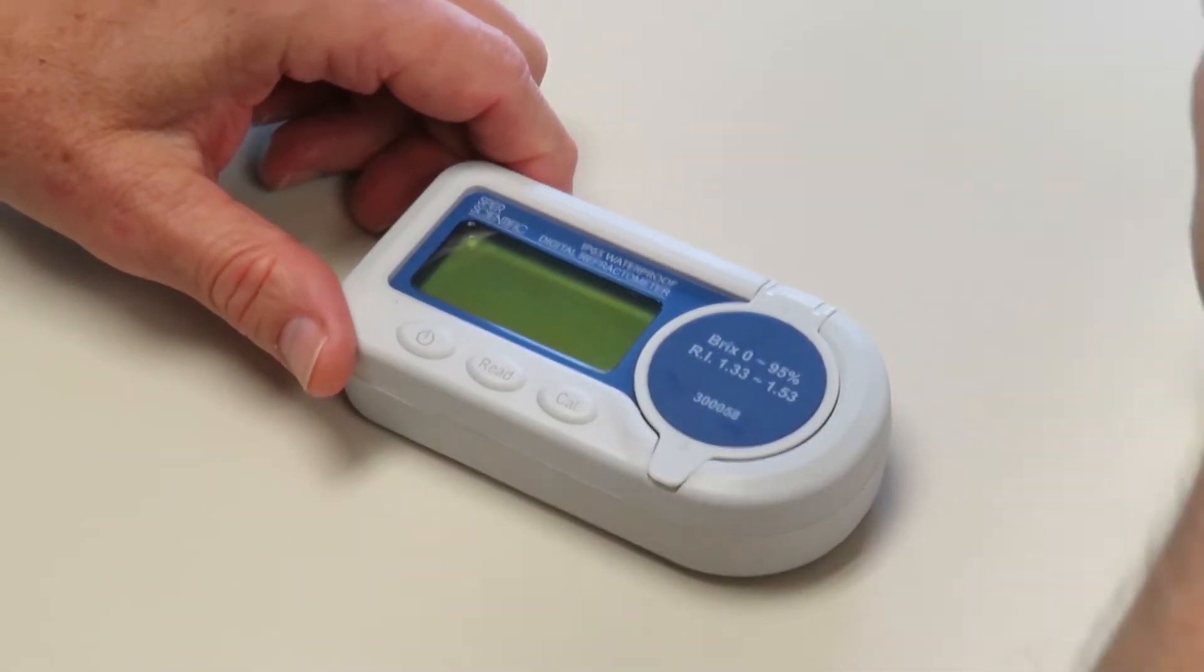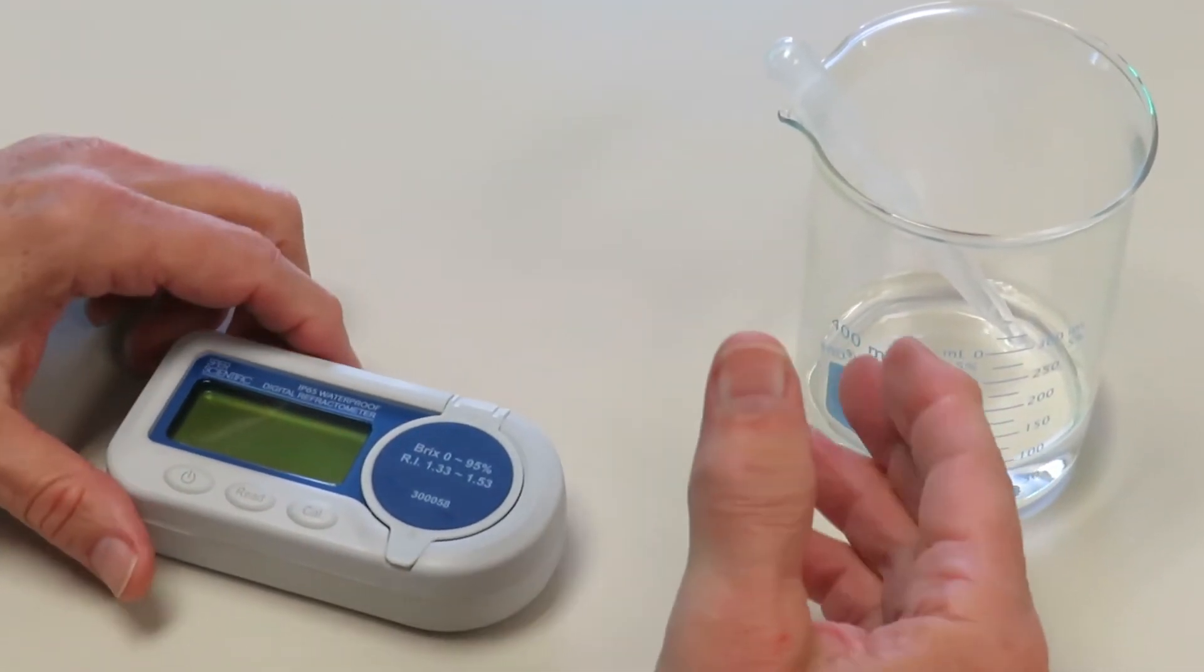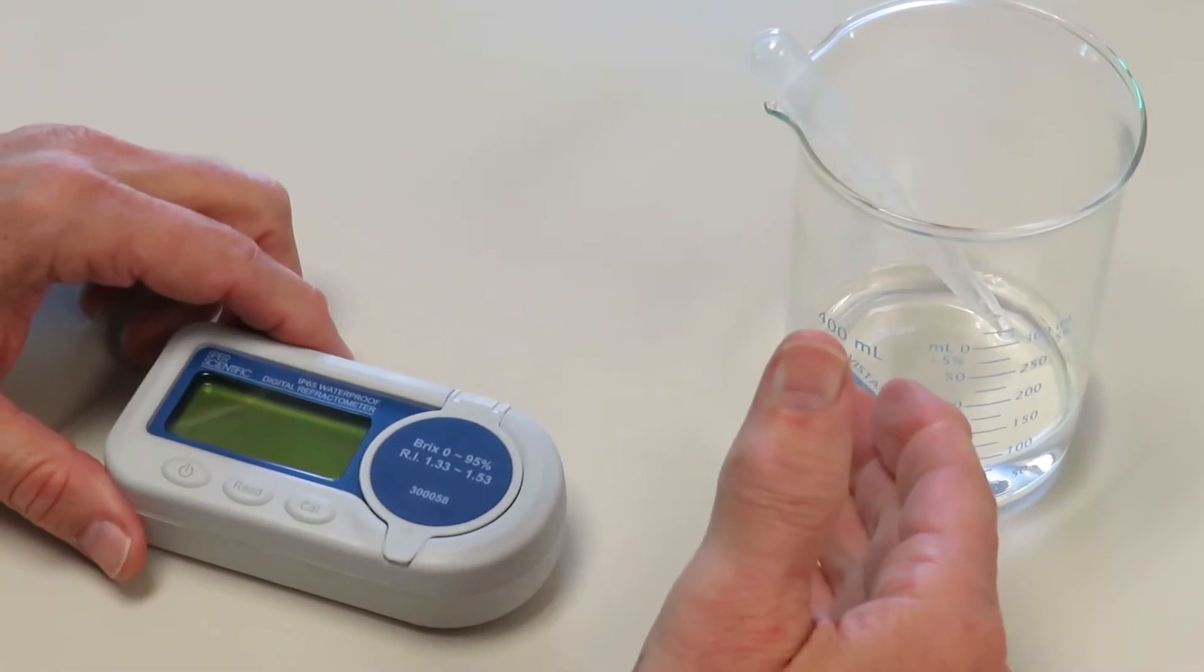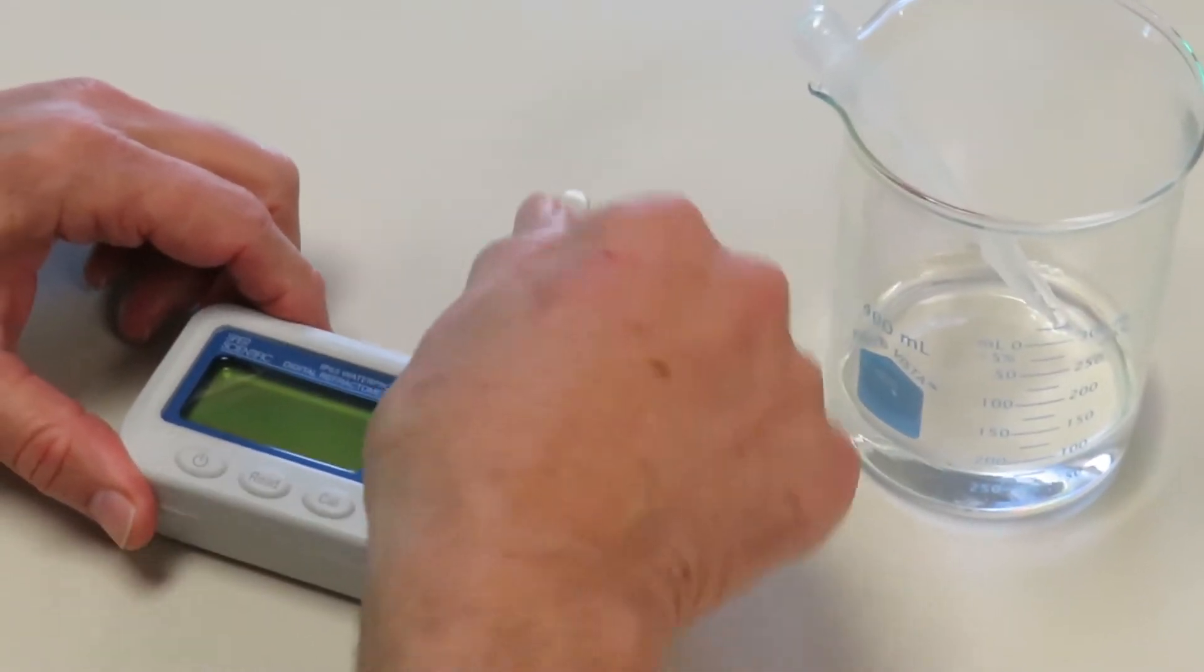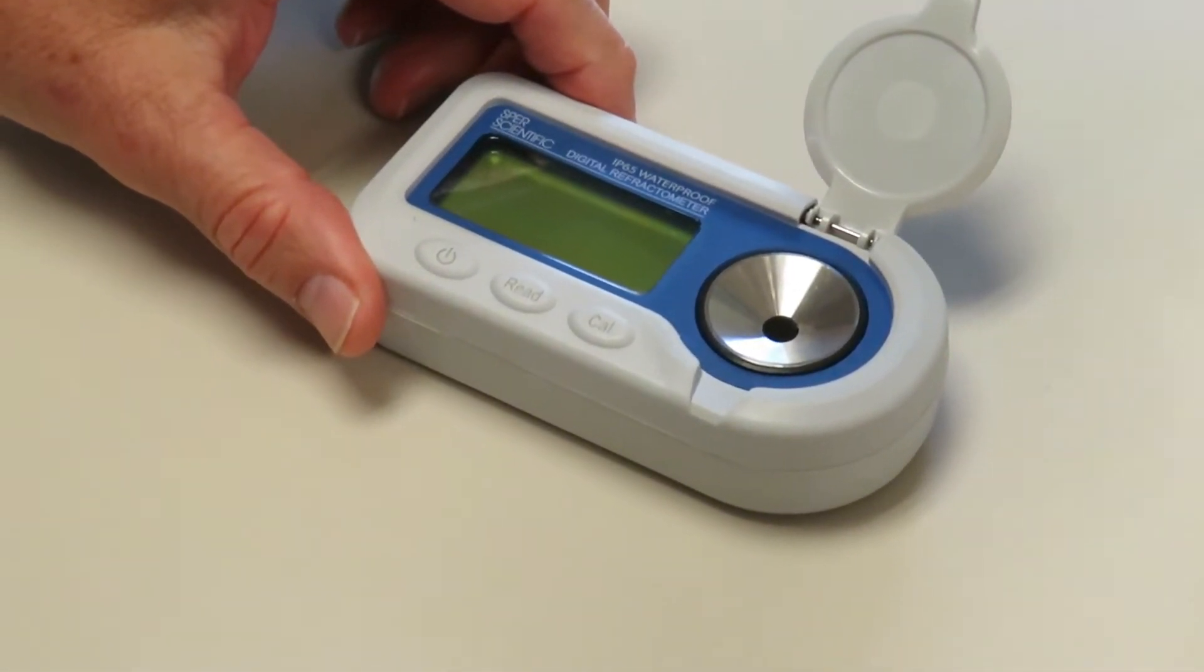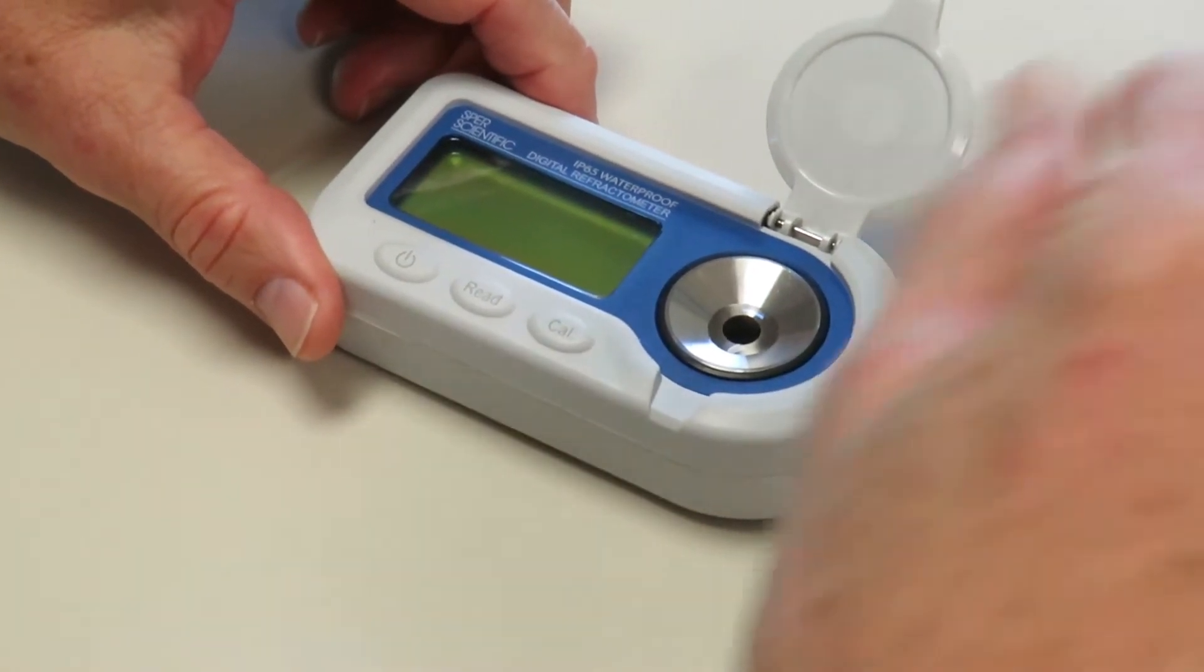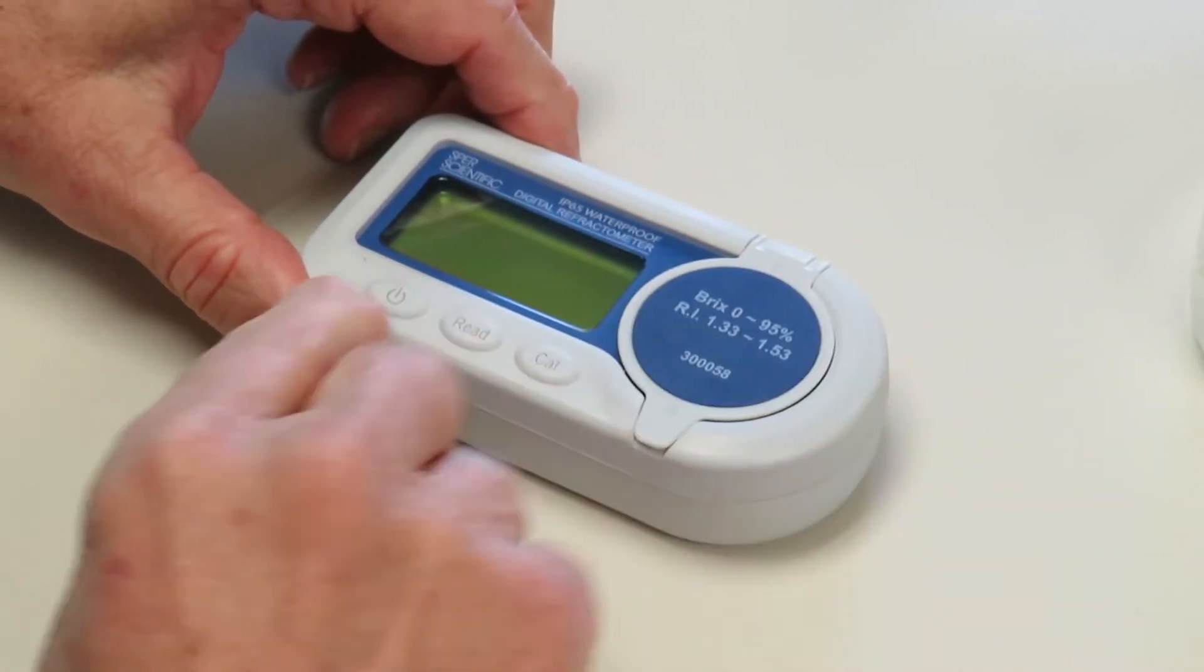First we'll calibrate it and we'll use distilled water. Now that's an advantage because if it was a calibration solution, that solution would evaporate over time and no longer have the same value, whereas distilled water always remains the same value. So all we do is we take some distilled water and we put it into the lens, making sure to cover the lens on the bottom of this well, and we cover it.